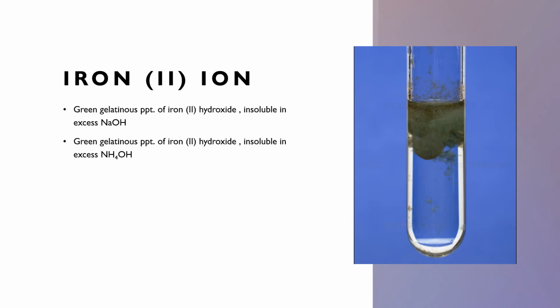For iron 2 ion, Fe2+, this is the green color of the precipitate. The green precipitate will not dissolve in excess NaOH because Fe2+ ion is not an amphoteric.